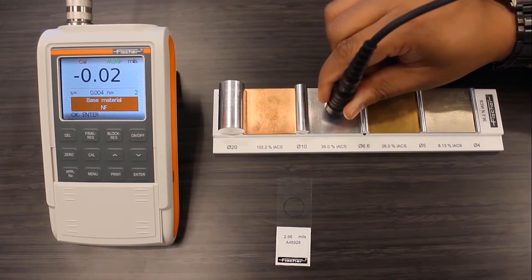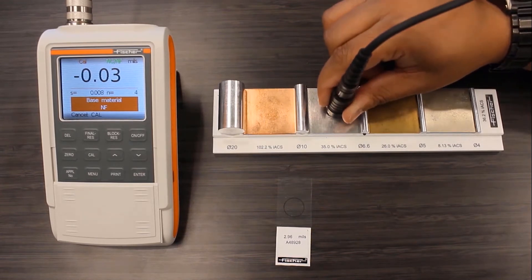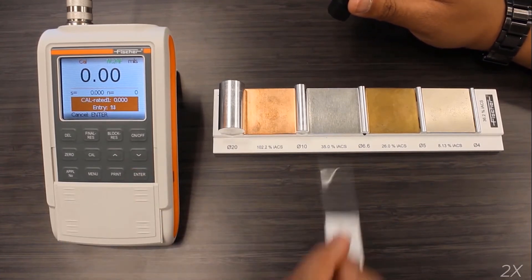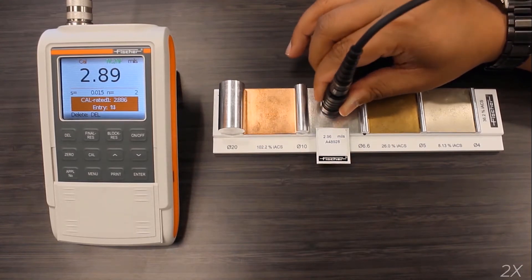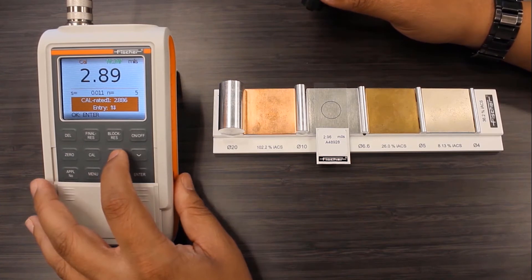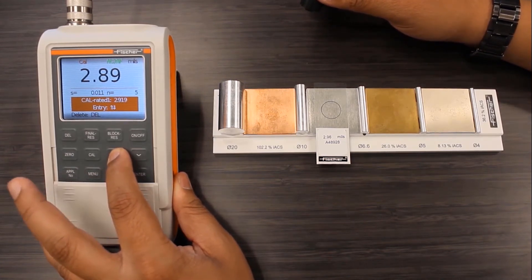I've selected a one-point calibration with five measurements — first on the bare substrate and then five more on the certified foil. I'm adjusting the measured value with the arrow keys to the stated value of the foil, which is 2.96 mils.